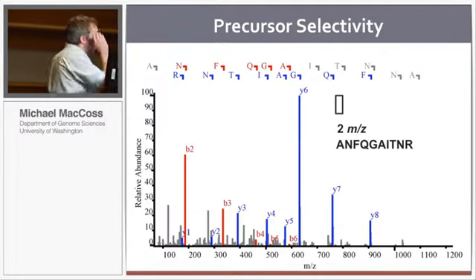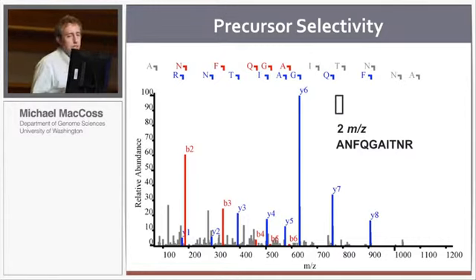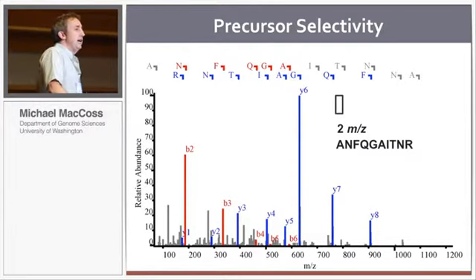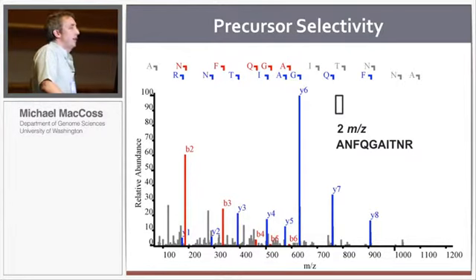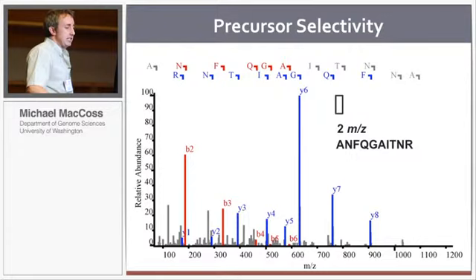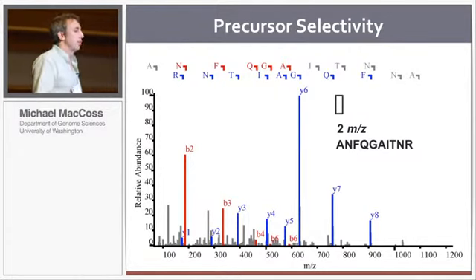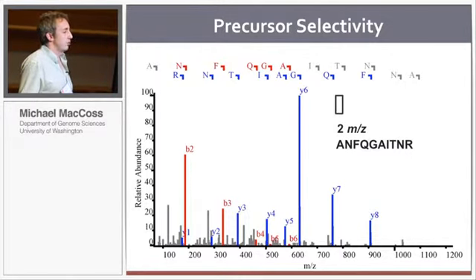One thing I want to point out in the last couple of minutes while I'm talking to you is that there is a major challenge with precursor selectivity in doing these data-independent acquisition experiments. You won't always hear about this in all cases, but I want to make sure this is very clear for people because it's something that's underappreciated, I think, because there's a lot of hype about using 25 mass-to-charge wide windows.